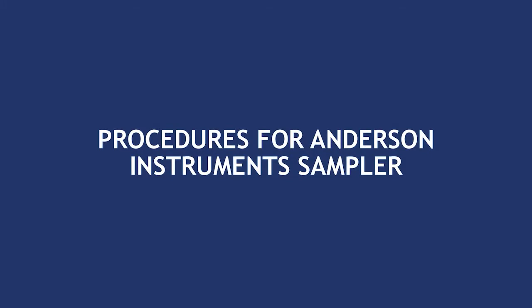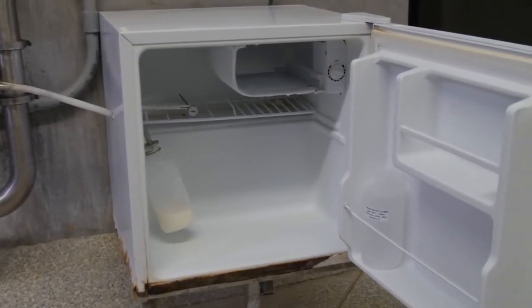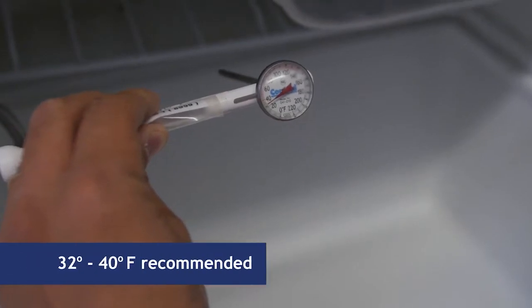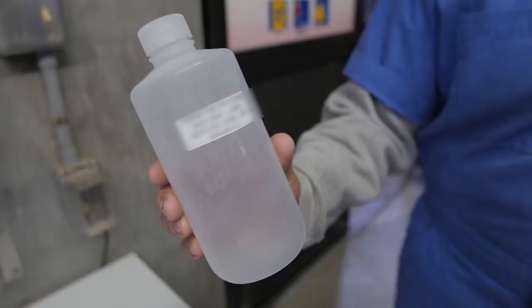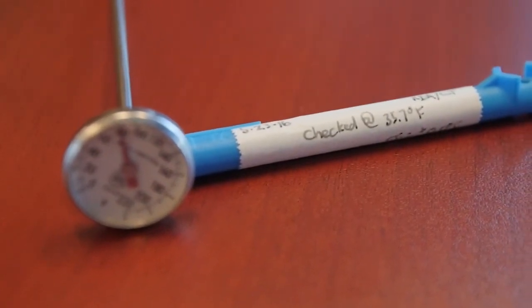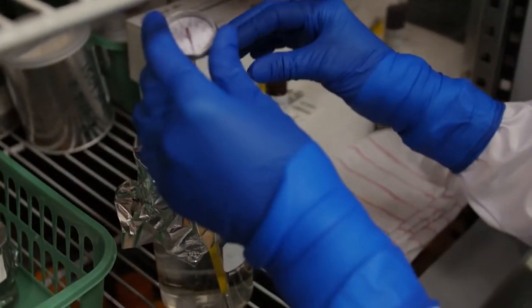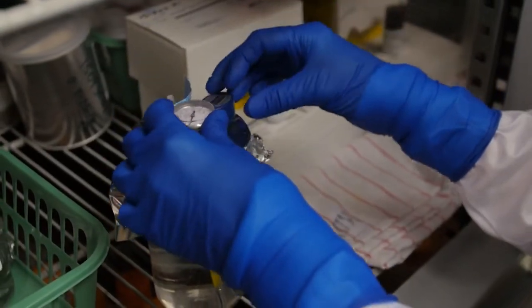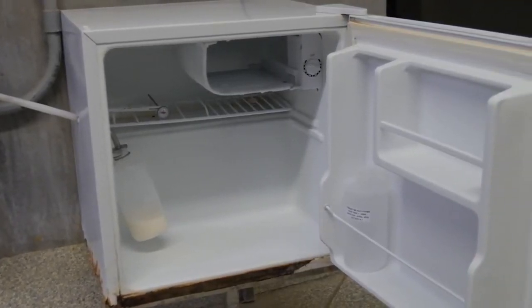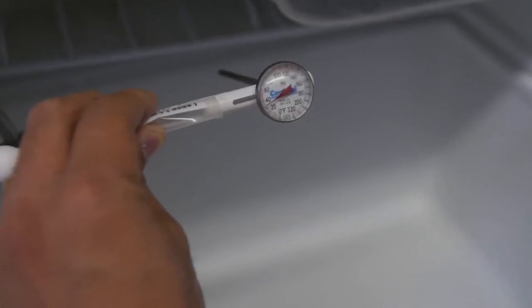We will begin with the Anderson Instruments inline samplers. The Anderson device is to be installed in a refrigerator that must maintain an internal temperature of 32 to 40 degrees Fahrenheit. The sample collection container, if not single-use, must be hand-washed and sanitized each time you use it. Use a calibrated thermometer to track the refrigerator temperature. The thermometer must be digital or liquid-filled in glass type and be checked annually by a certified laboratory. Two refrigerators are necessary: one for sample collection and one for sample storage.